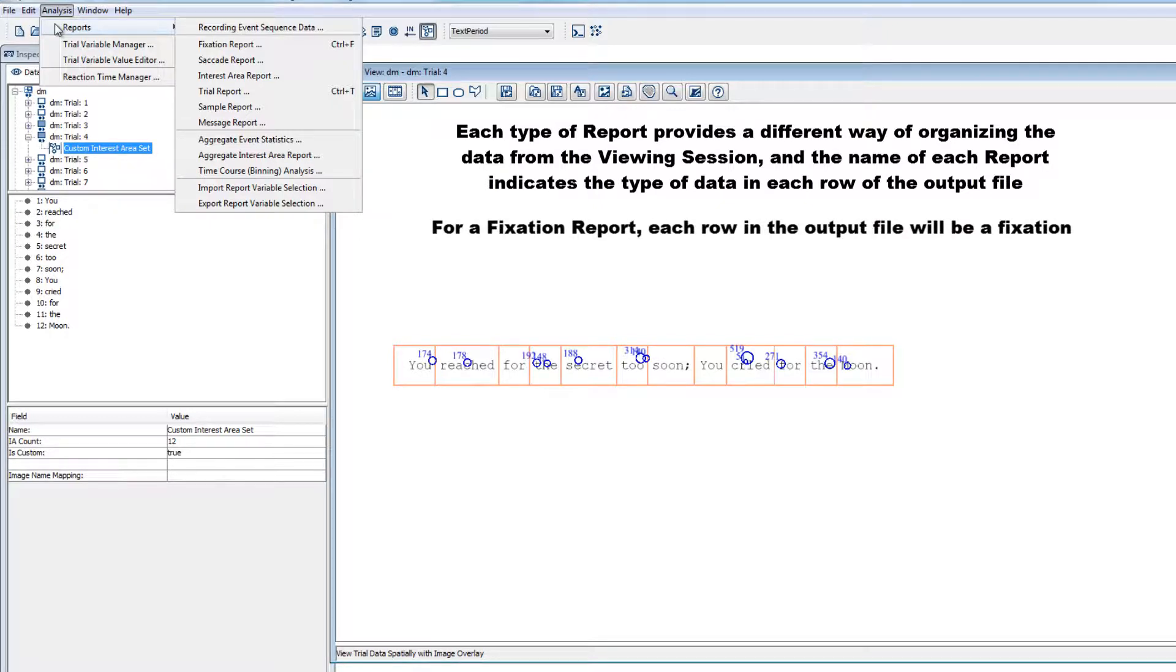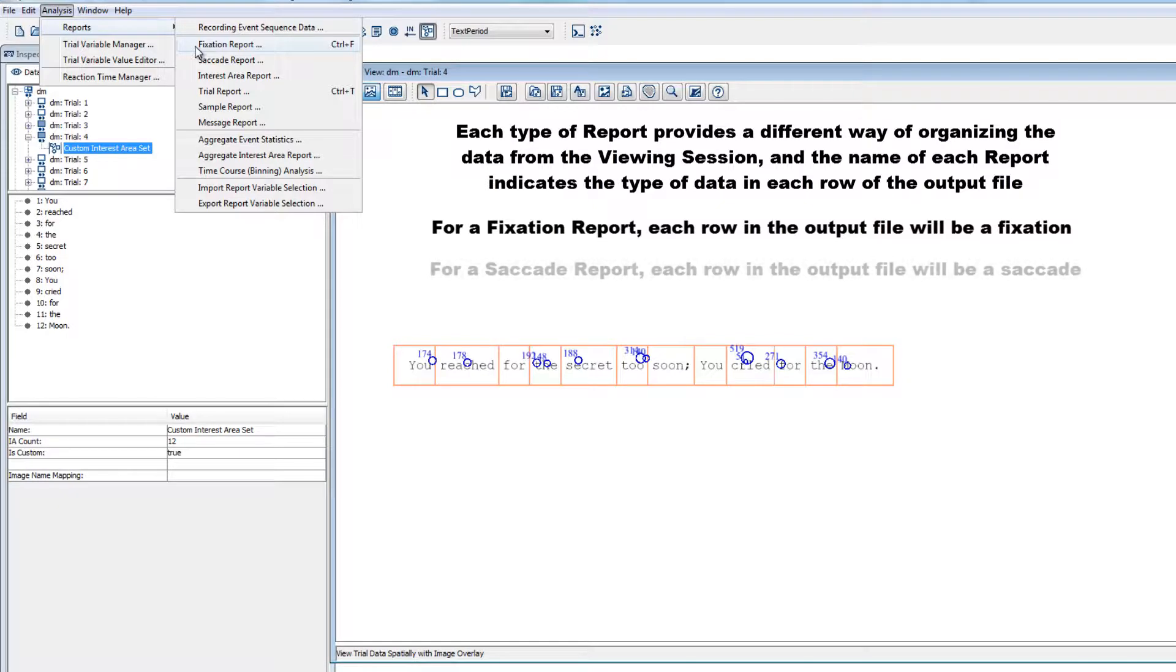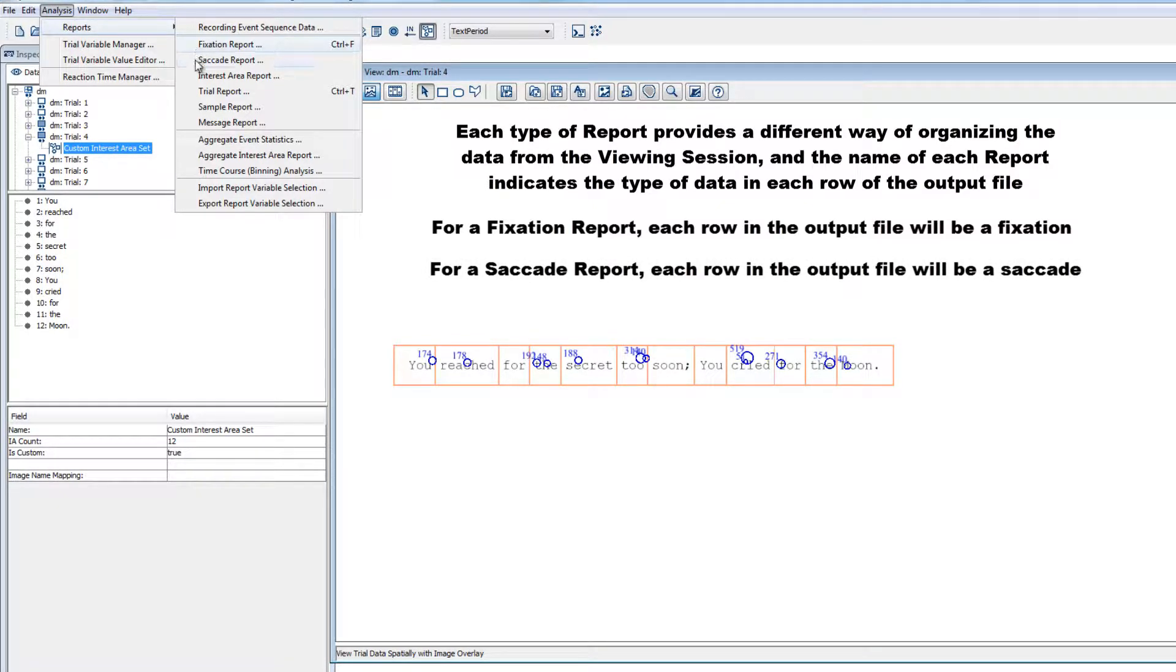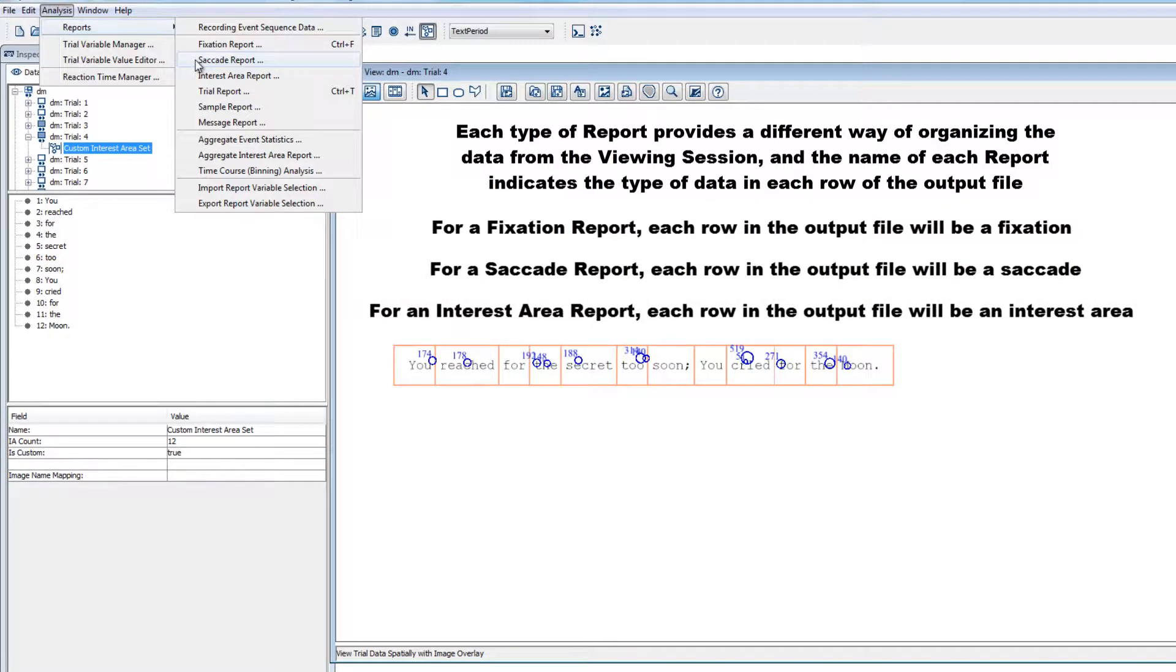If you create a fixation report, each row in the output file will correspond to a different fixation from the viewing session. If you create a saccade report, each row will correspond to a different saccade. If you create an interest area report, each row will correspond to a different interest area, and so on.